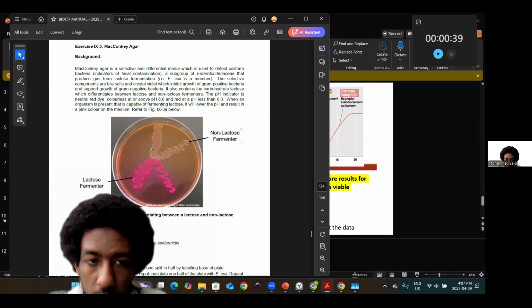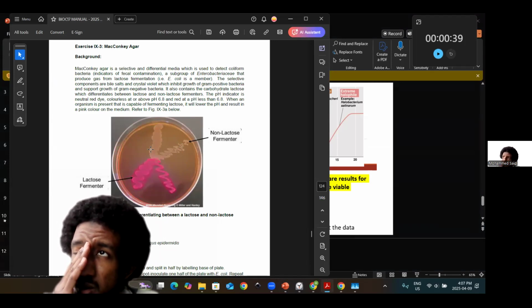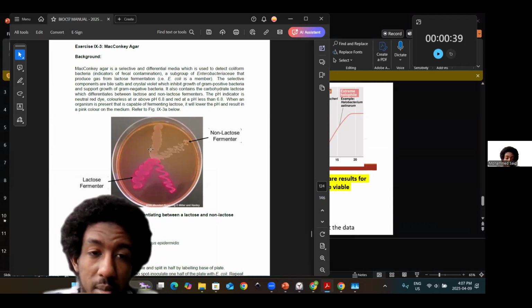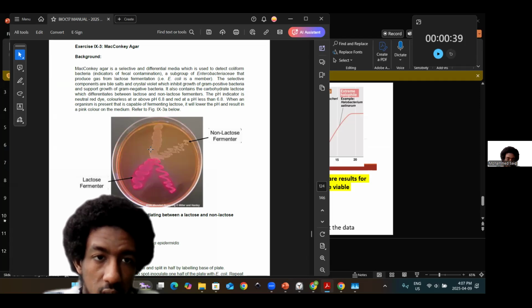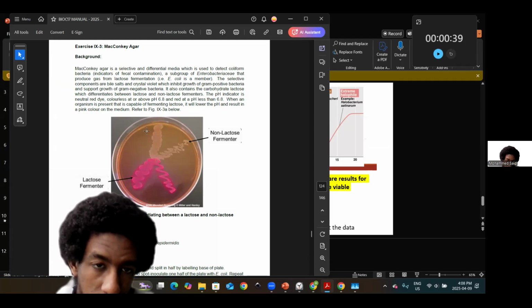And then the difference, just to clarify, from the gram-negative bacteria, those that ferment lactose, interestingly, depict a reddish pink hue, which can be shown here, and then a non-lactose fermenting bacteria, which you can imagine from what we've described as a hint, will give you a less than reddish hue.